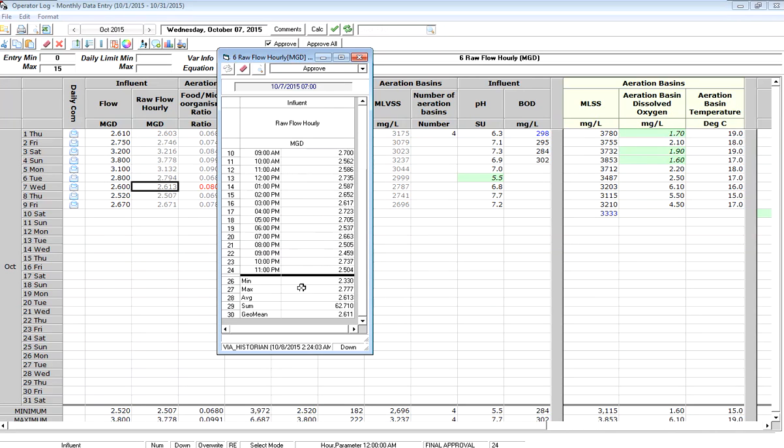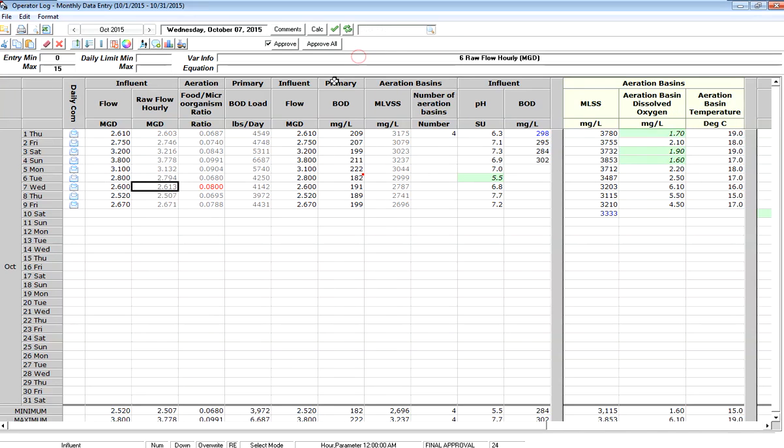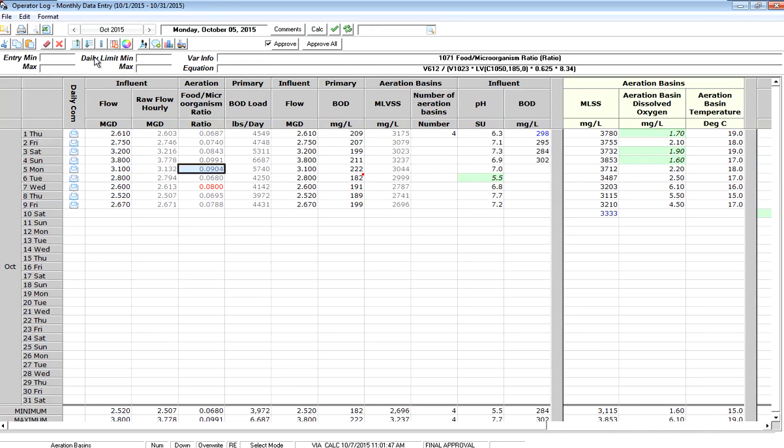I can scroll through that data, it shows me all of that. I can also look at any point, again, if we want to get a longer term trend or see this data in a graph. If I click on that column, I have a series of buttons and things I can do and one right here is to display a quick trend graph.